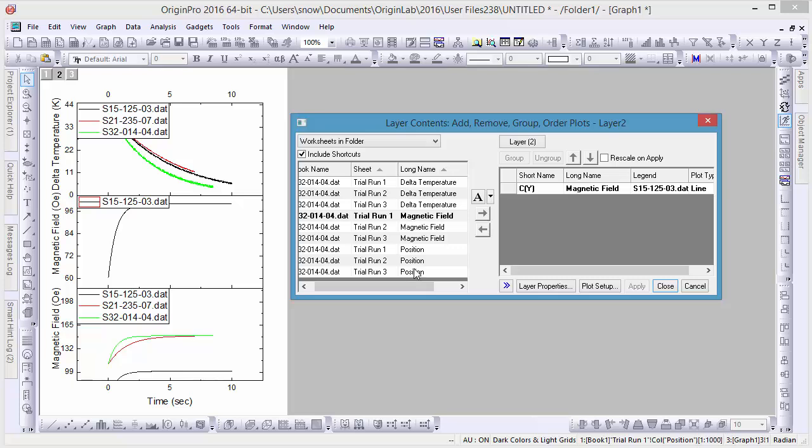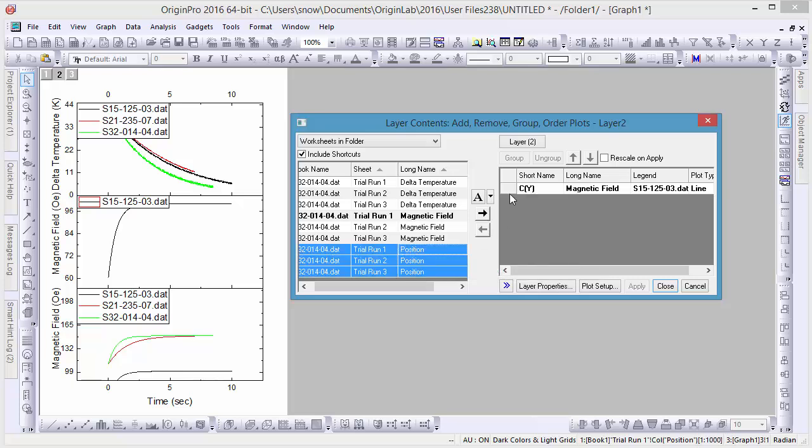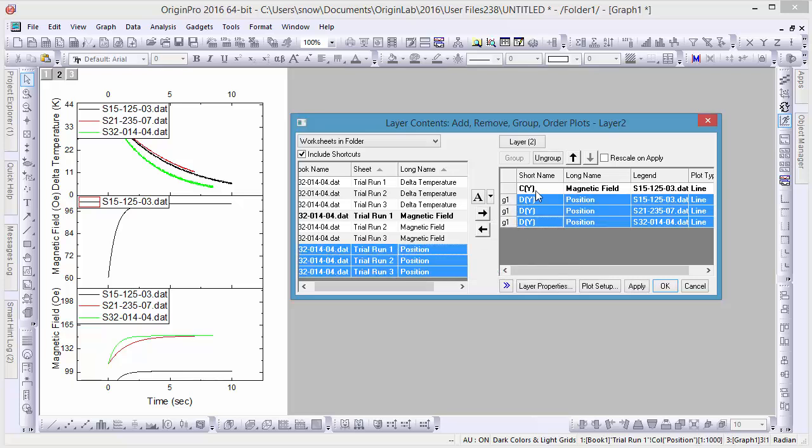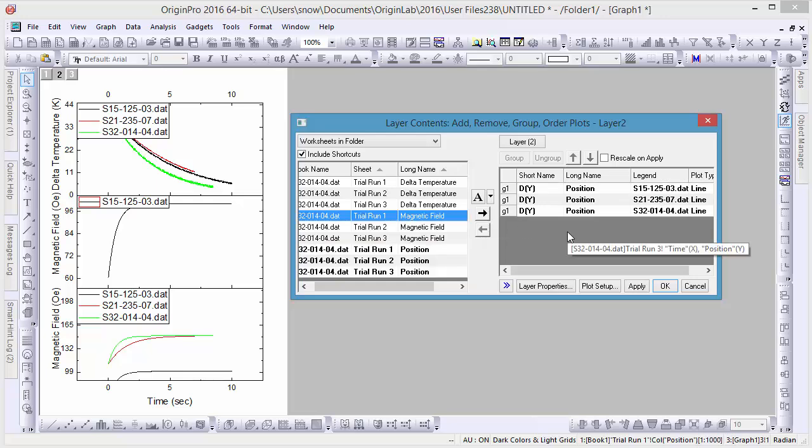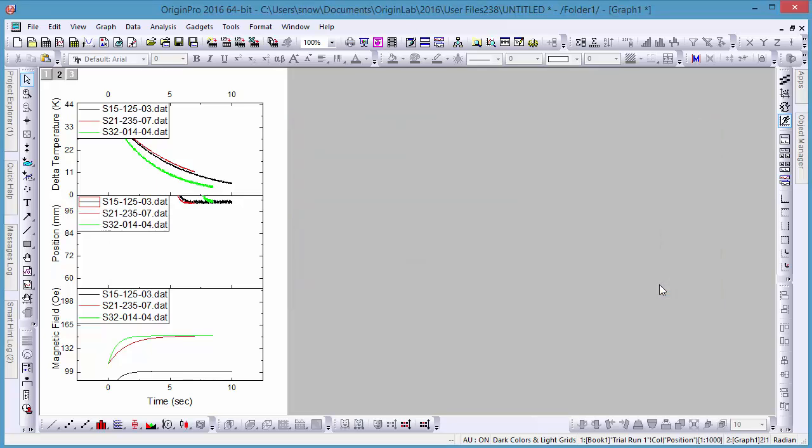After we're finished adding and removing columns in these layers, click OK to close the Layer Content window. Because the data sets in these columns make use of different units, we'll need to use the Rescale button to correctly display them.